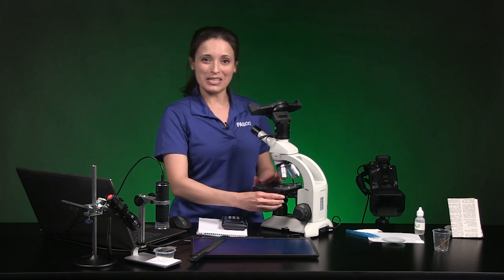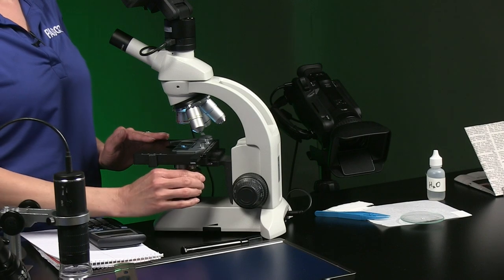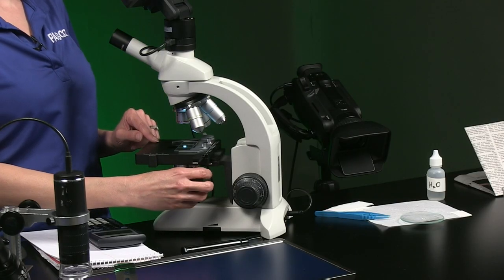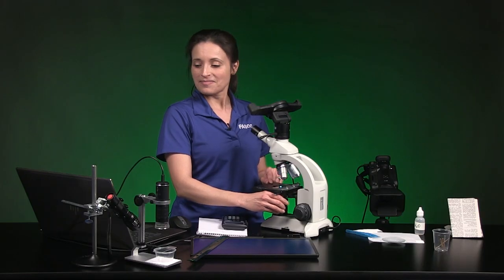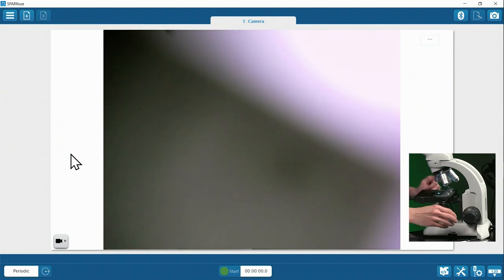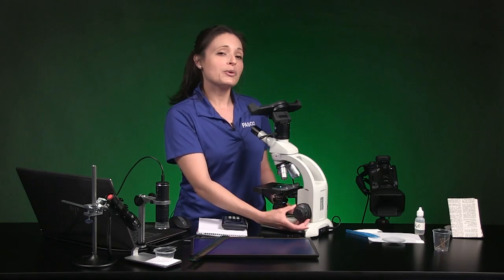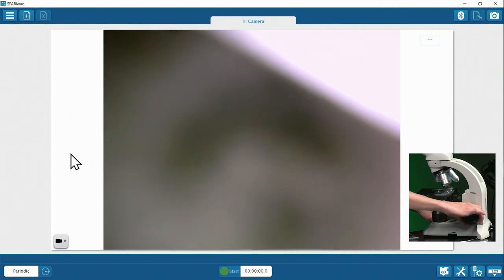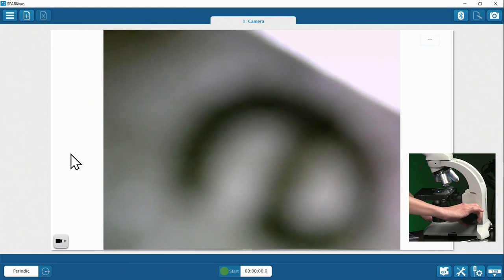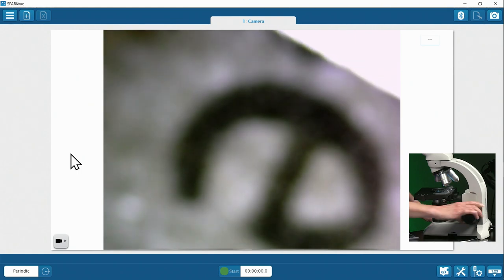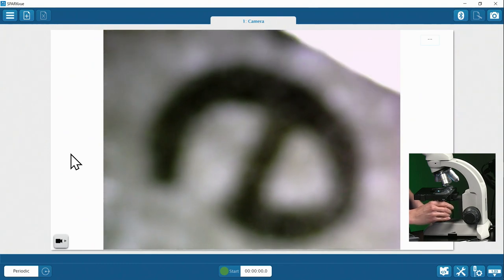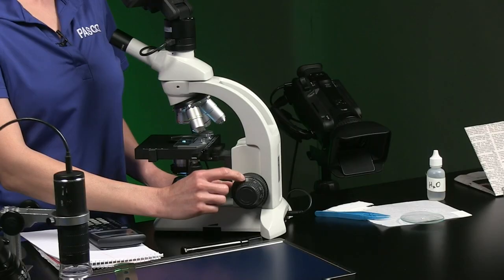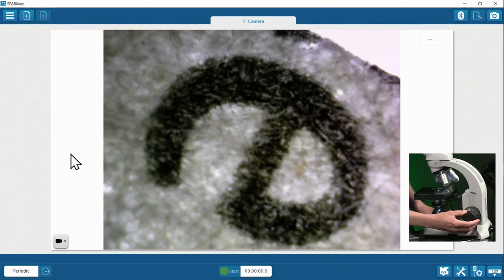Line up the E directly under the objective lens. My microscope has a mechanical stage, so instead of moving the slide by hand, I can turn these knobs to move the slide around. Use the large coarse focus knob to raise the stage until you start to see the E come into view. Slowly adjust the coarse focus knob until the letter E is in view, and as you go, move the slide to keep the E centered. When the E is almost in focus, switch from the coarse focus knob to the fine focus knob to make smaller focus adjustments.